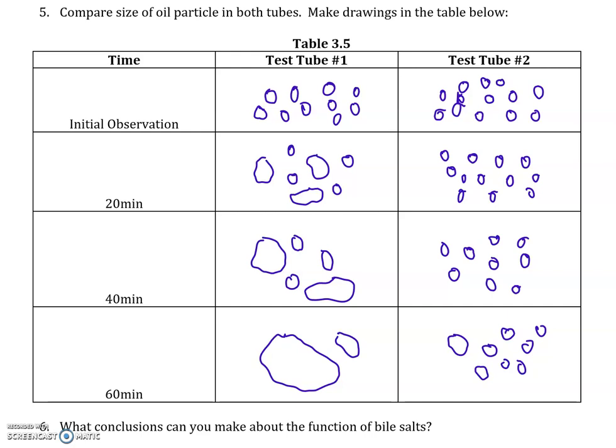But after about 20 minutes, the fat droplets start to merge in the test tube that doesn't have any emulsifier, as opposed to test tube 2, which has emulsifier — the droplets stay small. After 40 minutes it gets worse with no emulsifier, and after 60 minutes the oil droplets have all fused together into basically one drop. But in test tube 2 with emulsifier, the droplets are still small.